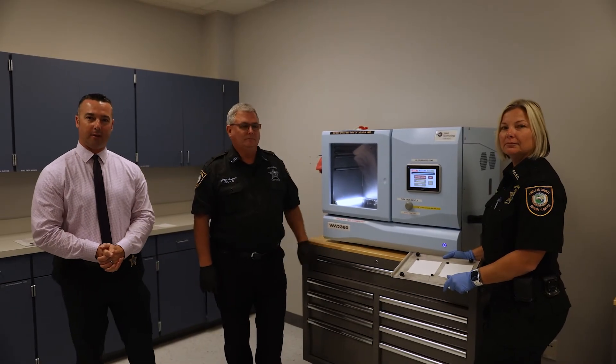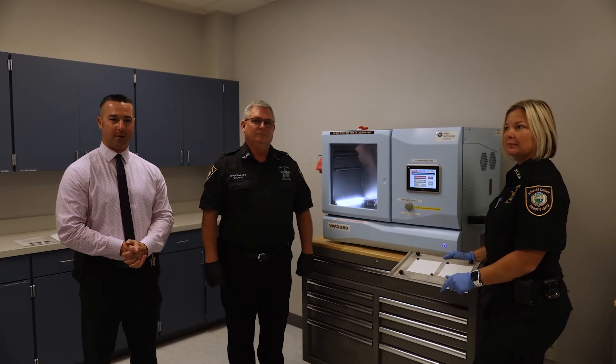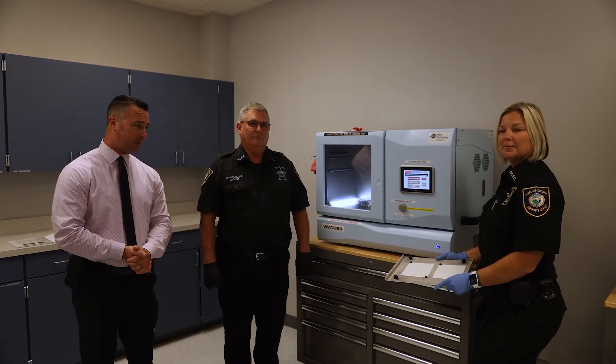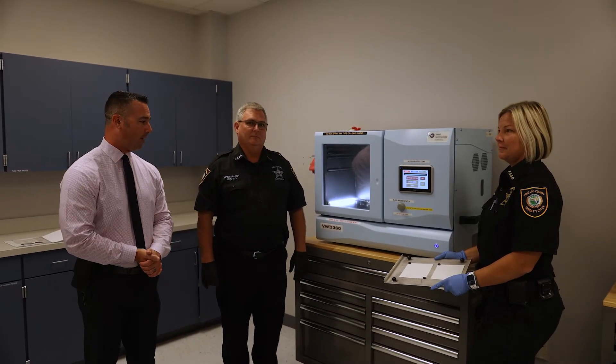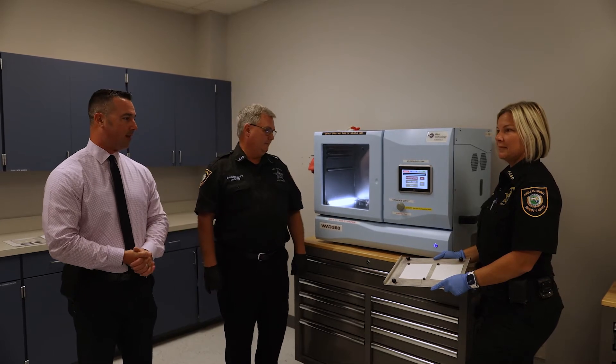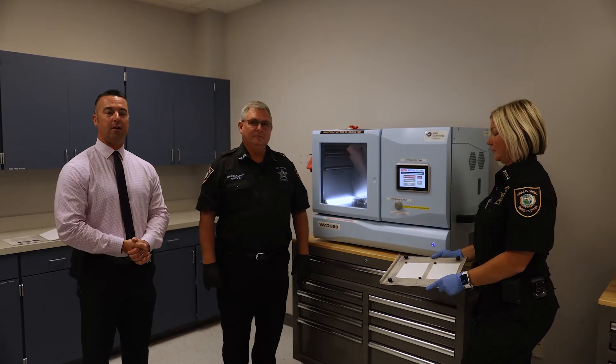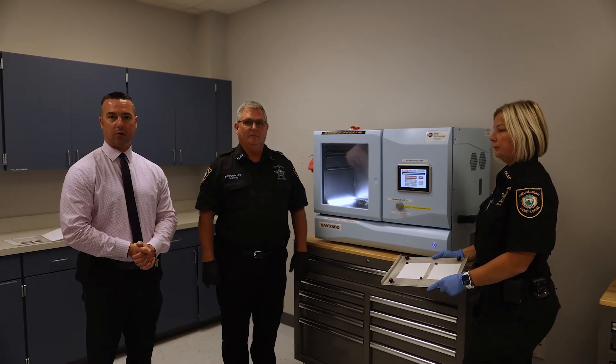Hello everybody, my name is Greg Danzig. I'm the lieutenant in charge of the Forensic Sciences Division. I'm here with Specialist Craig Giovo and Assistant Supervisor Rhonda Klein. Today we're going to be talking to you a little bit about the VMD 360, an evidence processing system that's unique of its kind and is a game changer in development of evidence for cold cases.